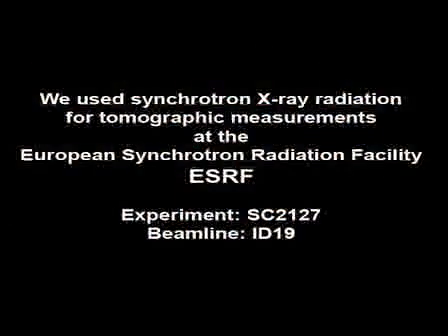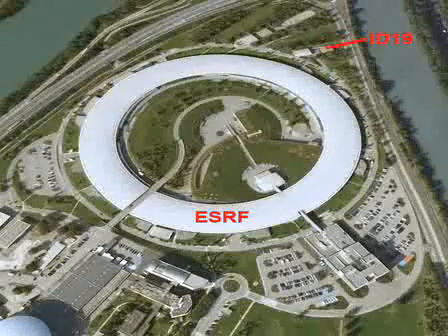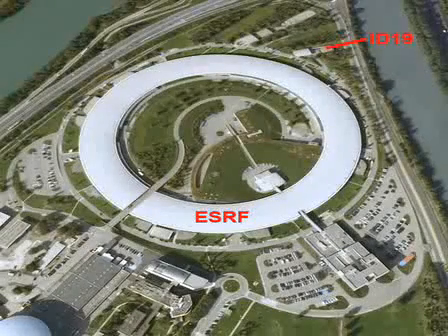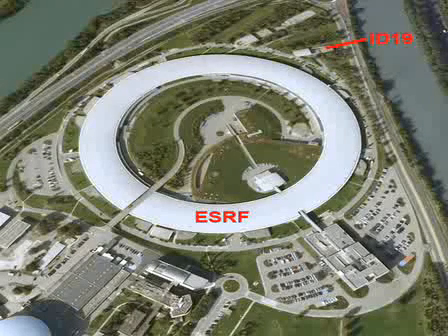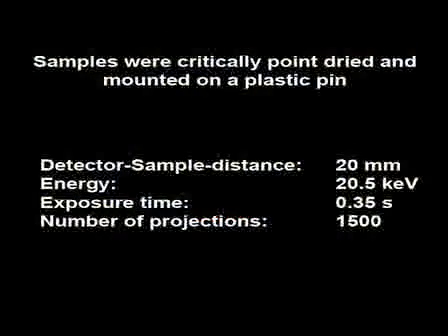on algae. To study the internal organization of Archegozetes, we use synchrotron X-ray radiation to produce tomographic voxel data at the ESRF in Grenoble. Here you see a picture of the ESRF with a large storage ring, and in the upper right corner you see the experimental hall of ID19, which is located outside the ring.